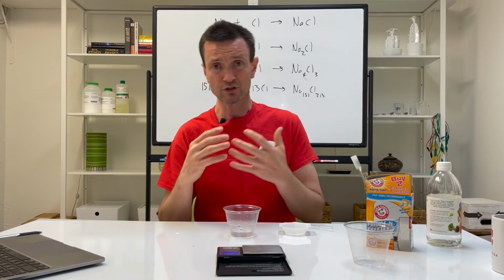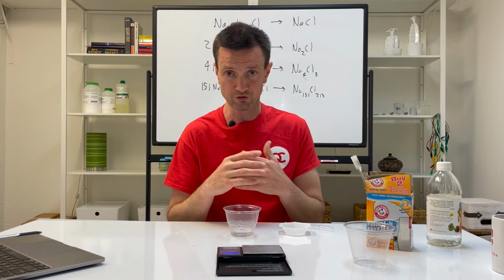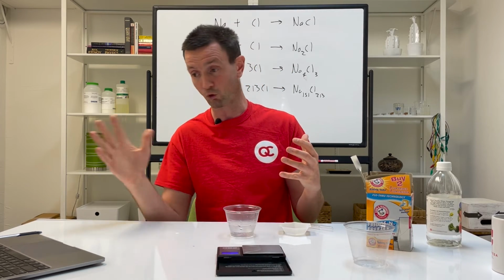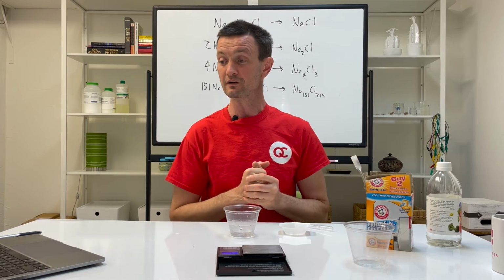So what do you see? Do you smell anything? Vinegar has a very distinct odor. Good, smell it. Do you still smell the same strength of the odor of vinegar? Again, record these observations in your data table, and do steps 4 and 5. There's interesting things to conclude from steps 4 and 5.